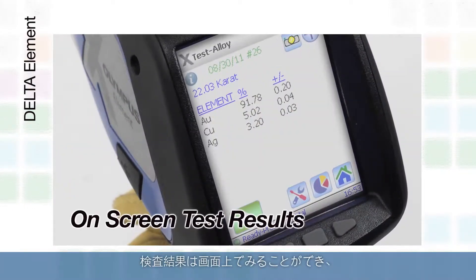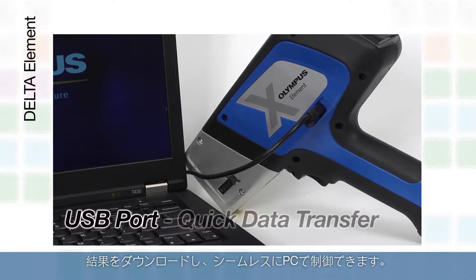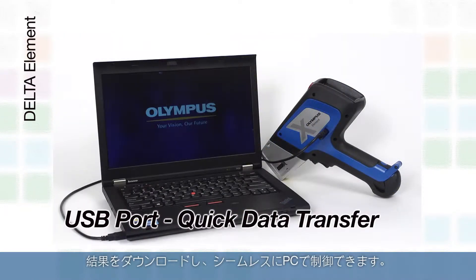Test results can be viewed on screen, and the analyzer has a USB port for downloading results and seamless PC control.